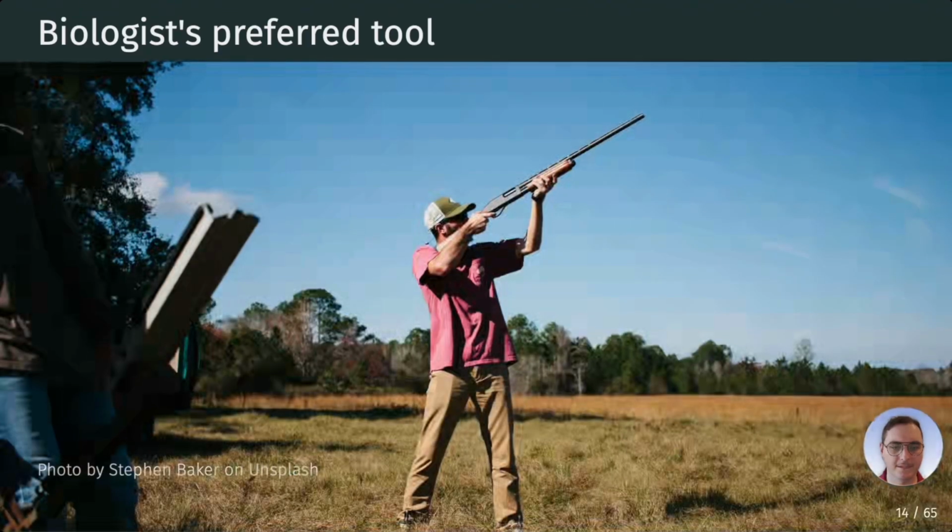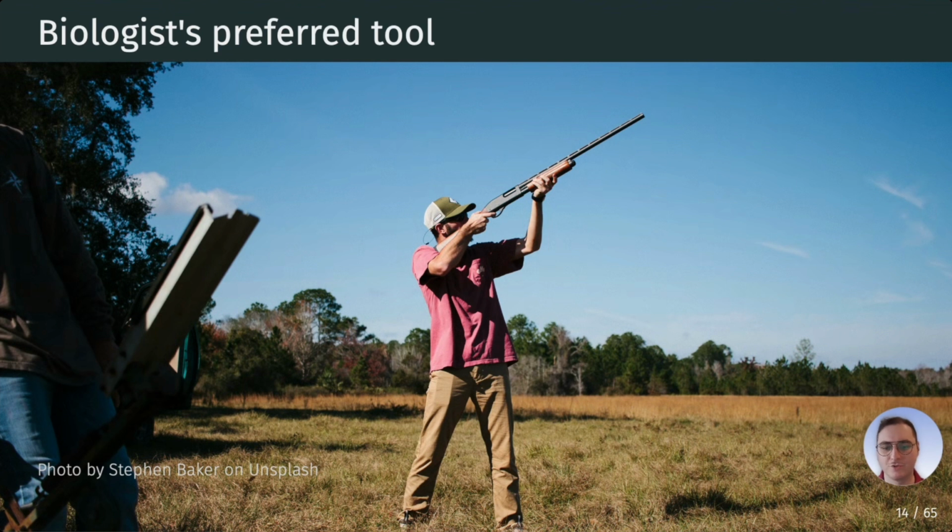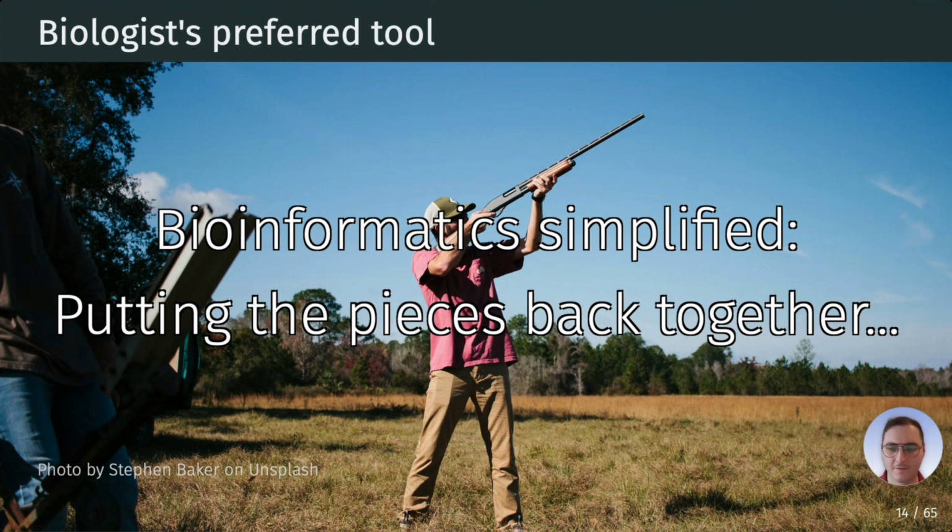And that is literally the term or the tool the biologists use. It's a shotgun that blasts the cell into small pieces. You use a chemical assay to extract just the DNA or RNA, and prepare it in a way that it can then be placed in a sequencing machine. And the sequencing machine gives out a lot of small sequences that, if we were to simplify it, our bioinformatics job is to put all those pieces back together and get an idea what might have been going on in the cell. And in case you wonder, yes, that is the technically correct term: shotgun sequencing, to blast everything apart.